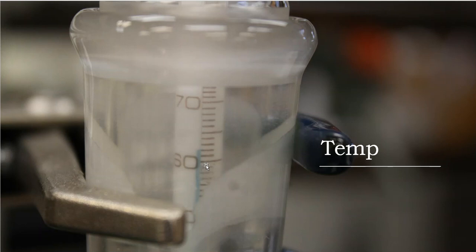And if you look at the boiling point of THF, what do you see? Well, it actually shows you about 67. But these are really crappy thermometers that we have in our lab, and I just don't like them. Part of the reason is that crazy immersion line on the thermometer. So it looks to me like they're going to be reading lower than what we want. And actually, the higher the temperature goes up, the lower the temperature is going to read for me. That's how those partially immersed thermometers work.